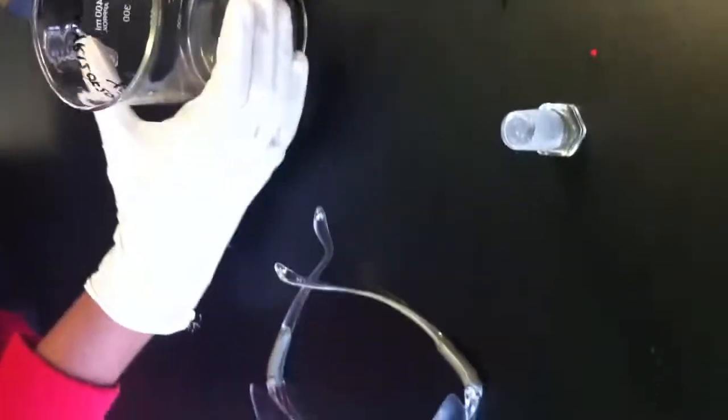100 ml. Wait, do we still need this? We may need it later, yes. Wait, what are you doing? That's not what you do. You pour 100 mils into that, right? That's what it says on the sheet. We're following the sheet. Natalia! Do we pour 100 mils of water into that? That doesn't work though. Yeah, pour it in a beaker. According to Gibbs, it does. Put that in there. You stir it. Make it sound okay, so put it into this. Yeah, no, but wait. We're trying to get the salt out of ours.